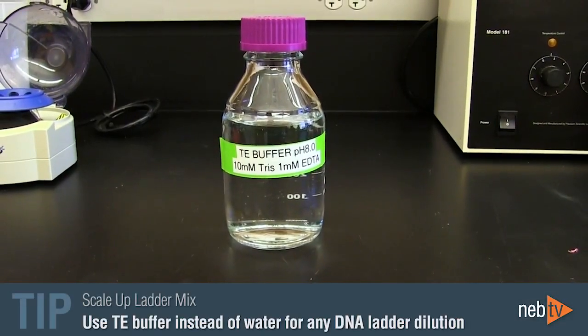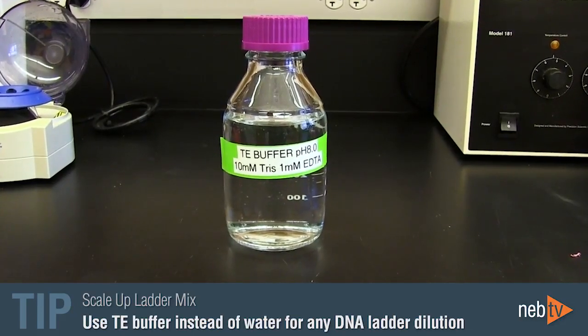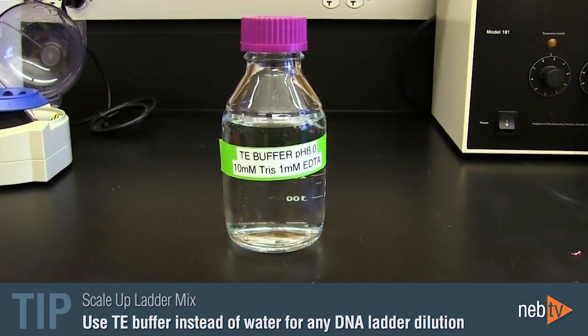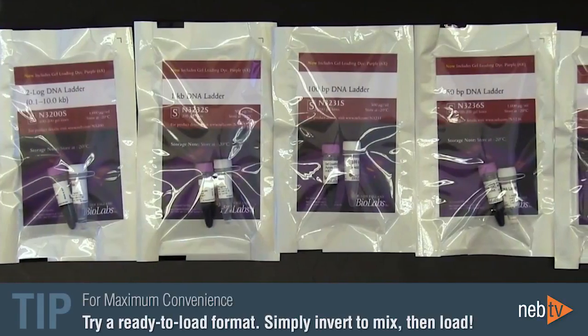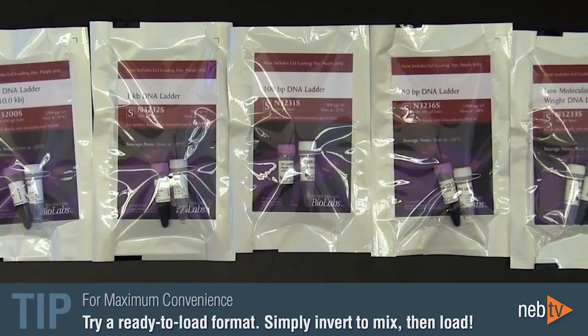This is why it is important to add the ladder to the diluted loading dye mixture. Alternatively, you can use TE buffer instead of water for any DNA ladder dilution to prevent DNA denaturation. For your convenience, NEB also offers an array of DNA ladders available in ready-to-load formats.